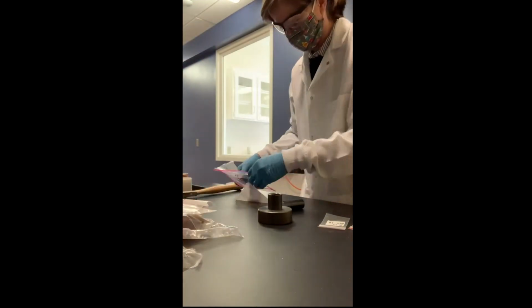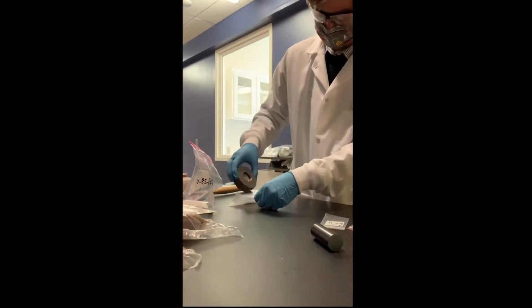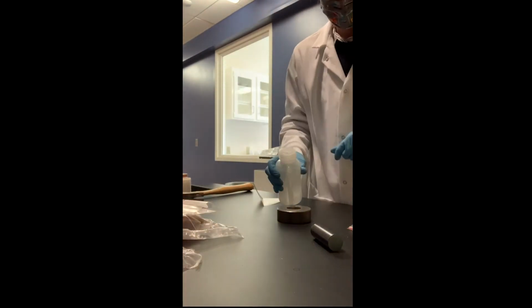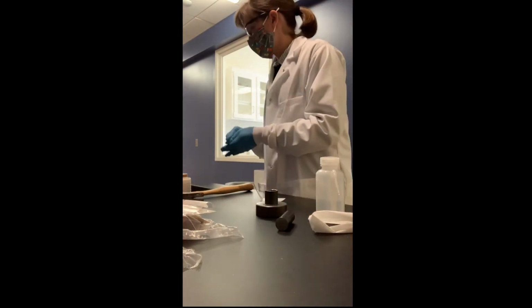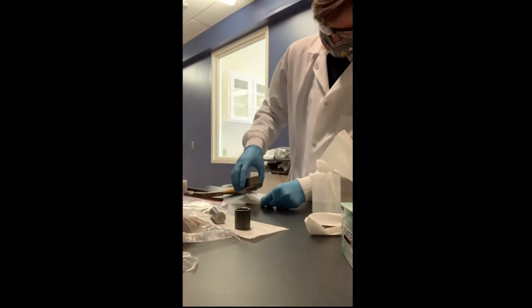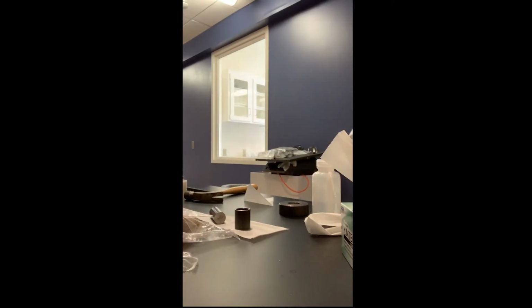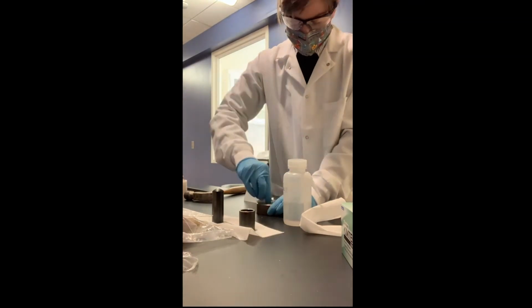So let's go. The first step with any sample is to take it and break it down into smaller and smaller pieces. This helps increase the surface area so we can go from a solid rock into something that's a solution. So you can see me doing that here with what we call a mortar and pestle, where I take the sample, I place it in this metal container, and then I smash it with a hammer, which is a lot of fun. You'll also see a lot of cleaning in between, and again, this is because we're so worried about contamination between samples, but also from things that may be falling out of the air.